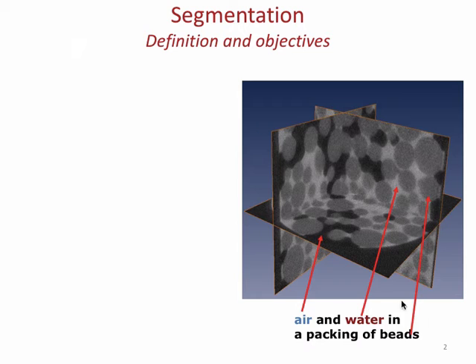Now, I could still average. If I was just computing porosity, I could actually find a reasonable value from this segmentation. So depending on the task, you might be doing just fine, but that's because I have positive and negative errors, so to speak. Identification of grain that is pore, and identification of pore that is grain, kind of cancel each other if I have noise like this.